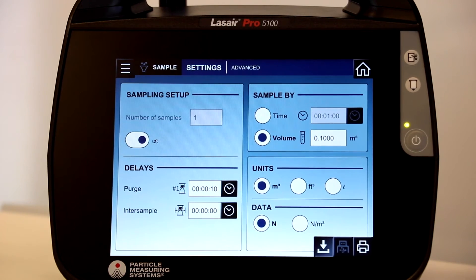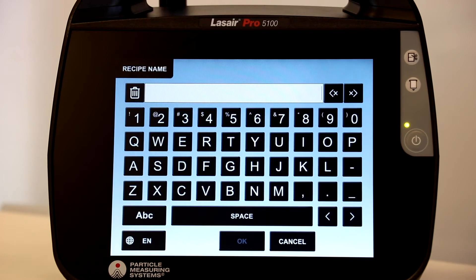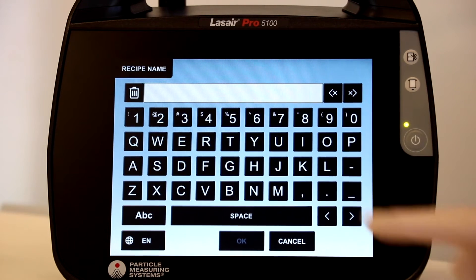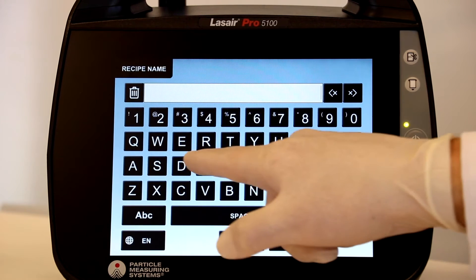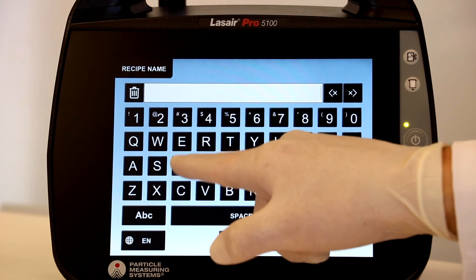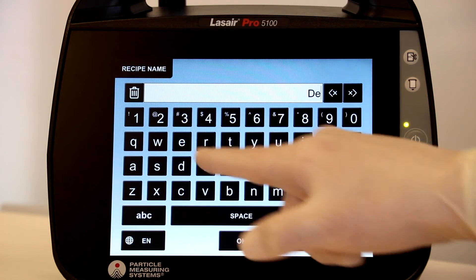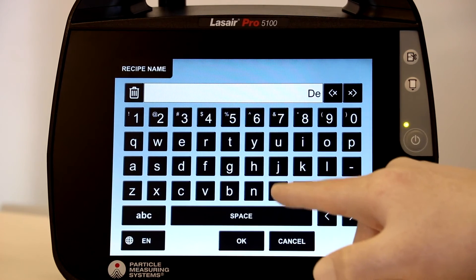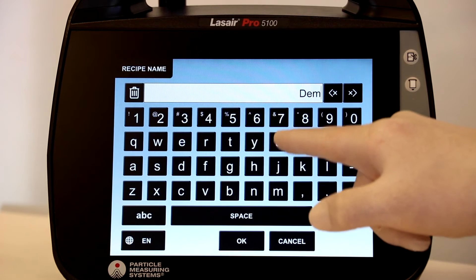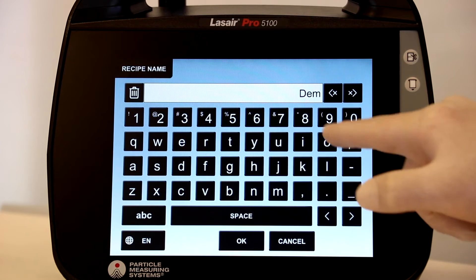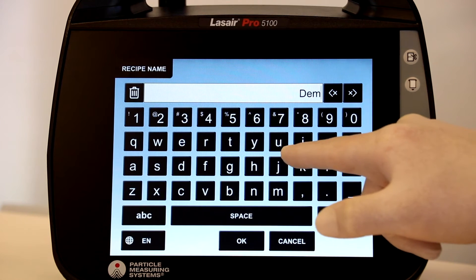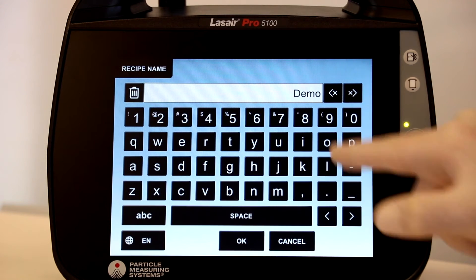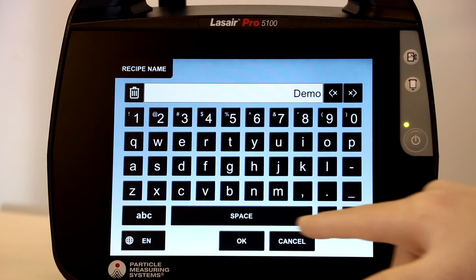After getting the desired settings, you will save the recipe and download it to the instrument. Here, a keyboard appears for you to name the recipe. Simply name the recipe and select OK.